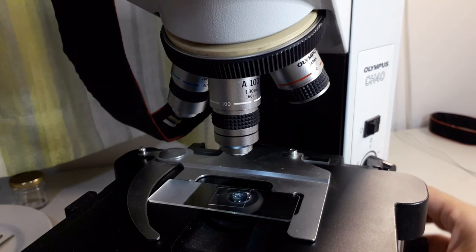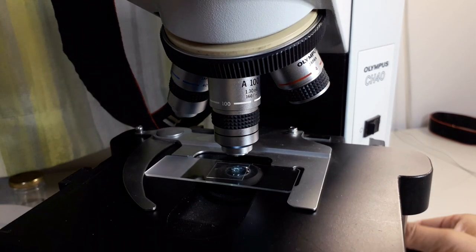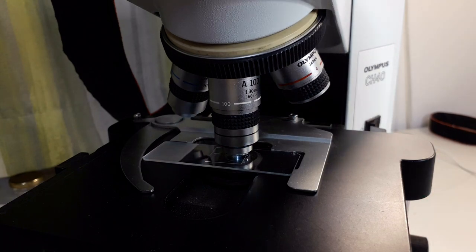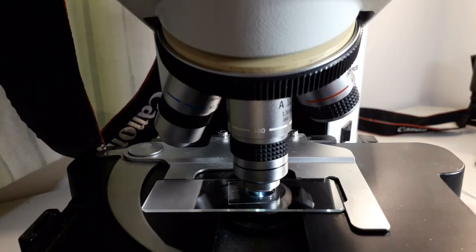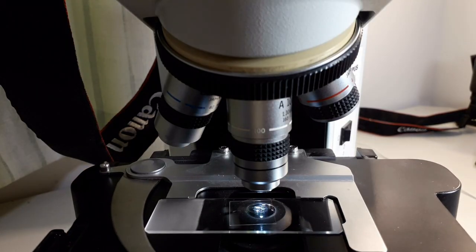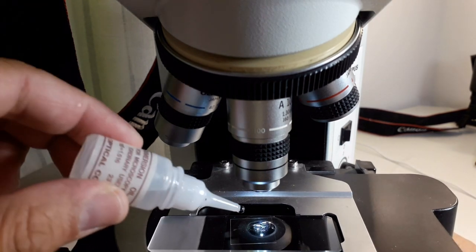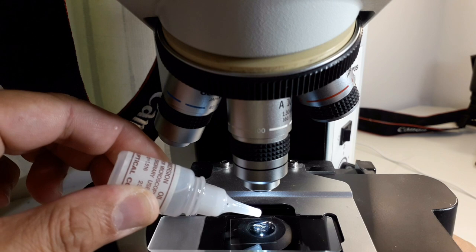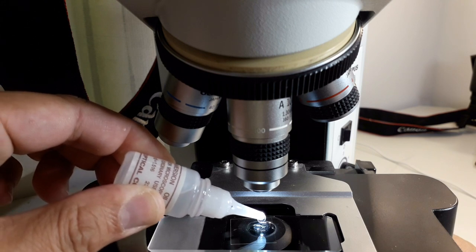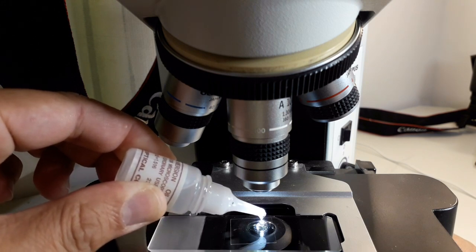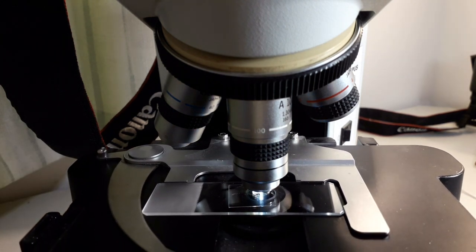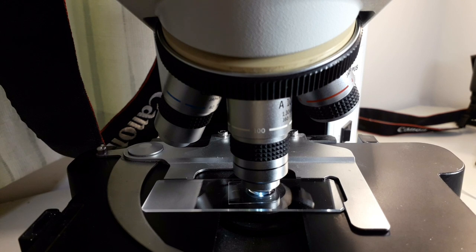So this is now the oil immersion objective in place. When I use the coarse focus knob, I can raise it all the way up and it will not crash because, as I told you before, it has remembered the position of the stage. What I'm going to do now is I'm going to lower the stage, I'm going to add a drop of immersion oil. I like synthetic immersion oil because this one does not solidify over time, and I place a small drop directly on the cover glass. I raise the stage again and that's basically it.